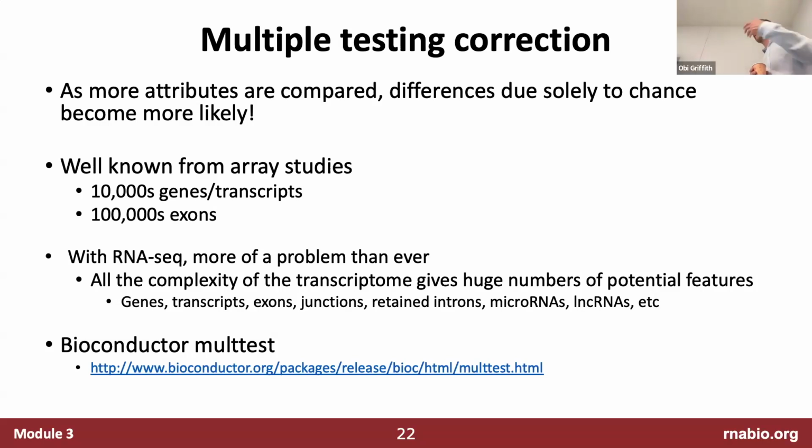So similar to Kallisto and StringTie, where you can get both TPM type measures and raw counts, or estimated raw counts, and you could feed those into, say, DESeq or EdgeR. That would be, I guess, the answer to your question, if you wanted to do differential expression with a count-based approach starting from the RSEM output. Thank you for clarifying that. Any other questions?